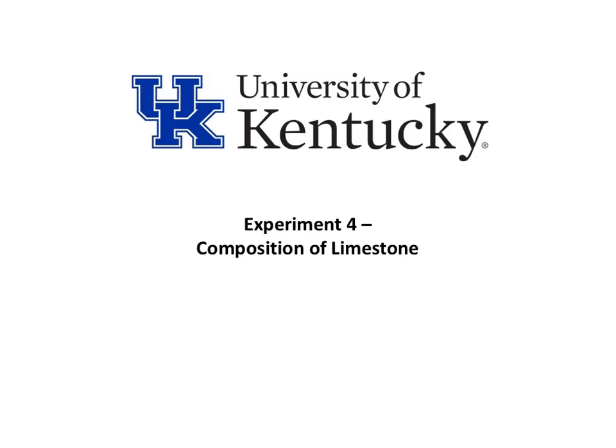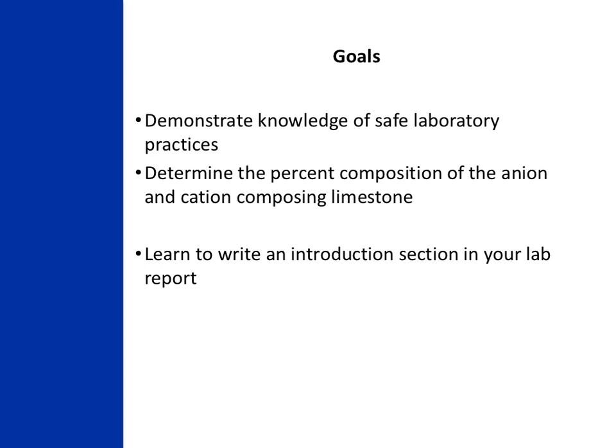In this experiment, we will be determining the composition of limestone. In this first week, we'll be working with highly concentrated chemicals, so it's important that you pay close attention to your TA when they go over laboratory safety procedures. This is where the laboratory safety mindset that we've been building this semester will really come into play. In this lab, we're going to examine the composition of limestone.